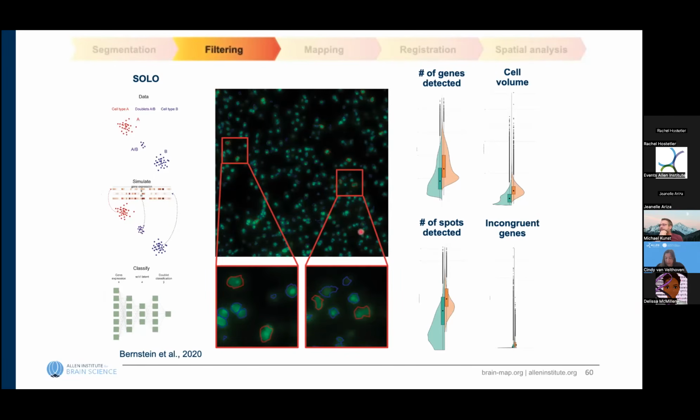And again, we have to play around with finding the threshold to set for a singlet or a doublet. And again, we have the advantage that we can actually look at the data and visually verify: do we have a singlet or do we have a doublet? So in red, you can see the cells that have been identified as doublets.